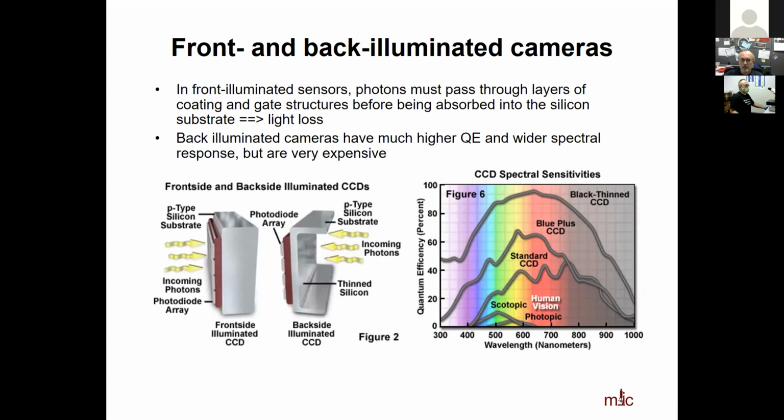Okay, so we have the sample prepared. We pick the right objective. You're looking at the microscope, and then the question is, how do you record the image? Of course, on a digital camera. There are a couple of different kinds, and you'll see them on the next slide once I show it to you. But typically, you have either front illuminated cameras or back illuminated.